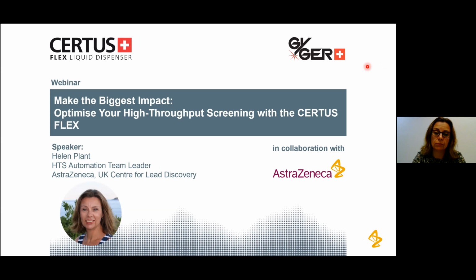Thank you very much. Thanks, Sarah, and thank you for the invite to present today. So yeah, I'm based over in the UK, in Alderley Park, and I head up the automation team within the HTS group over here. As Sarah's mentioned, we've had the CERTUS FLEX for several years, and I'm going to talk to you today about some pieces of work that we've done to really optimise that device to enable us to use it as a high throughput screening piece of kit.